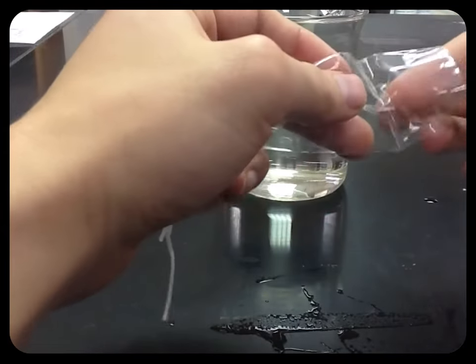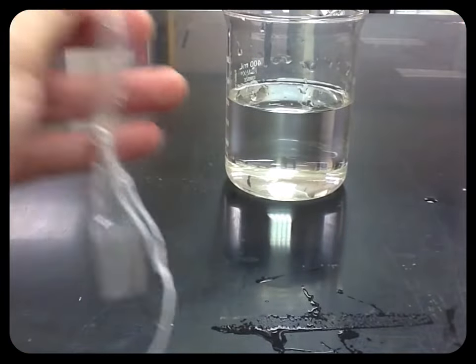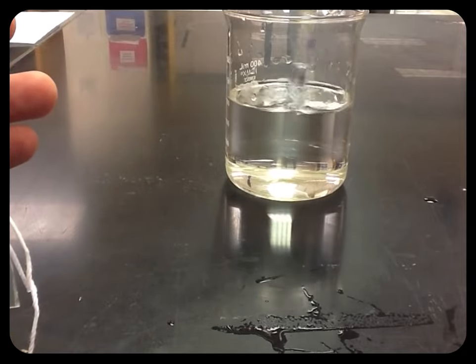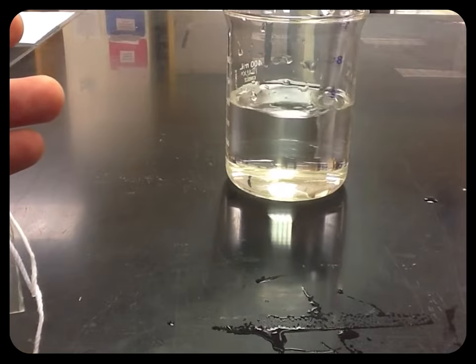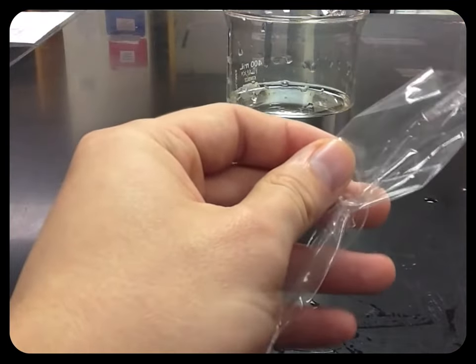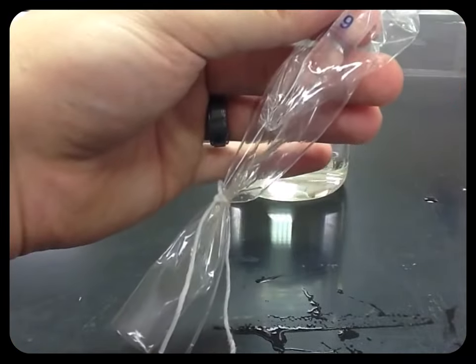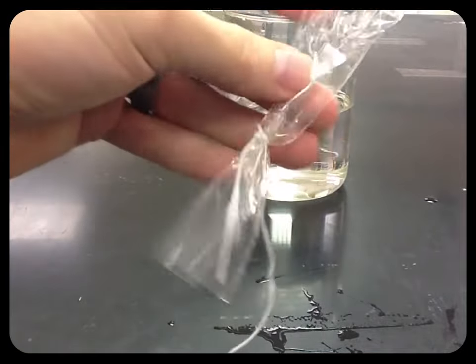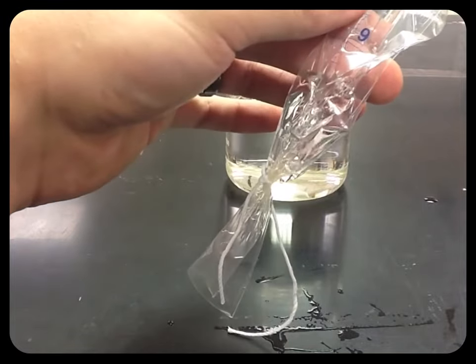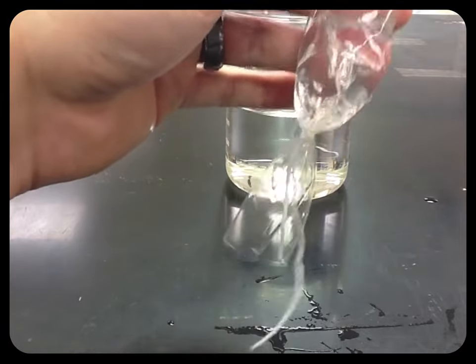Okay, now we're going to put something inside there. So we're going to set up at least two different situations. So one of them, we're going to put just water inside the bag. So it's going to be hypotonic inside the bag because it's just water. So here he is filling it up, trying to get it in there. And then he's going to seal it off, and we're going to see what happens. Now, if I put that bag of water in a beaker that has water, nothing's going to happen because it's isotonic. There's the same amount of stuff outside as there is inside.